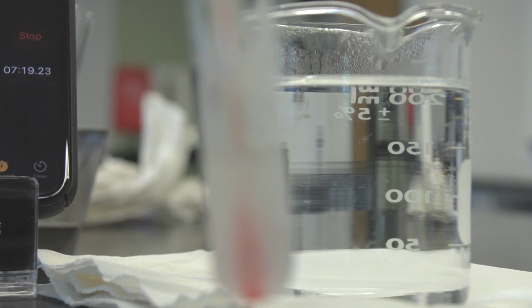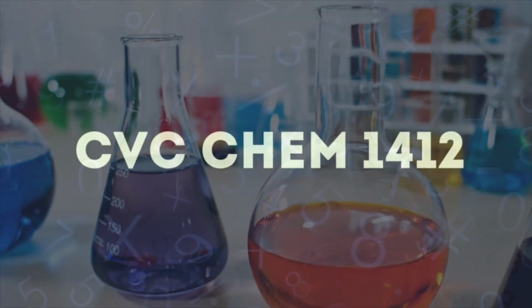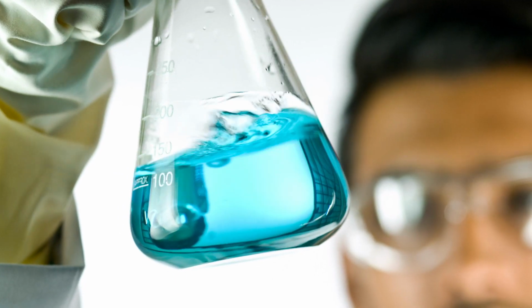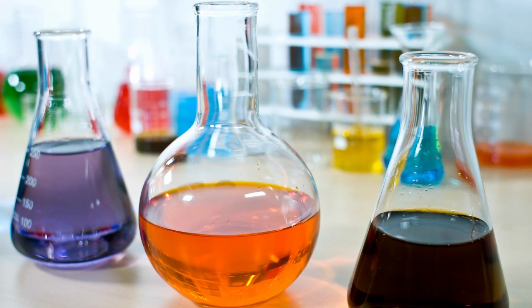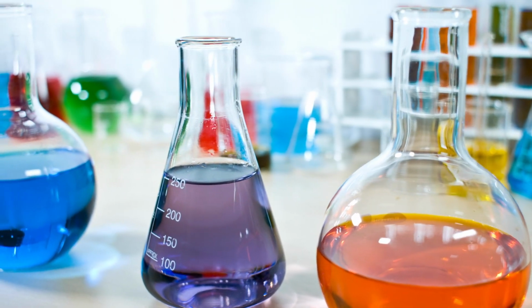Once this second trial is complete, dispose of the weigh boats, spoons, and test tubes with their contents in the trash. Do not pour the warm lauric acid and benzoic acid down the drain of the sink. It will solidify and clog in the pipe. Rinse and dry the 250 milliliter beaker and thermometer. Return the thermometer to its holder. Clean and sanitize your workspace.